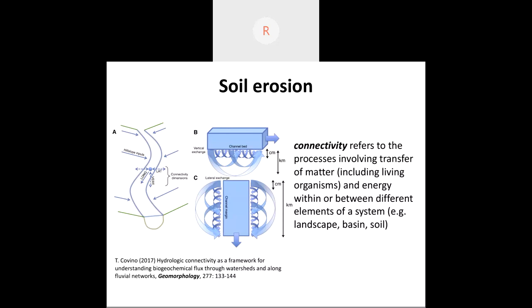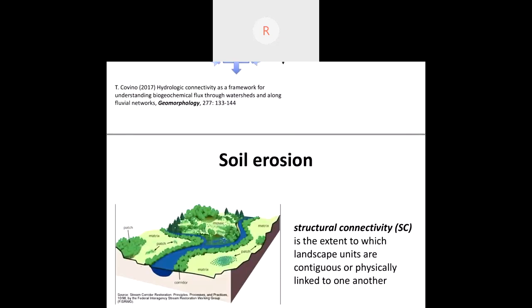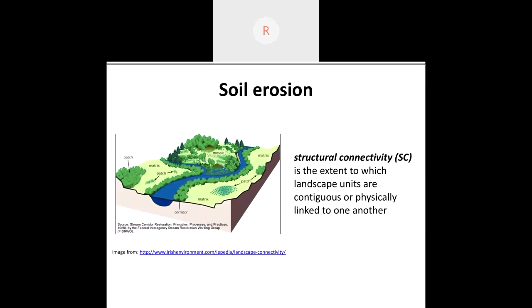So we think that FFC relaxometry can be used to monitor the connectivity from a quantitative point of view. Let me show which is the idea behind this. We can define two different types of connectivity.